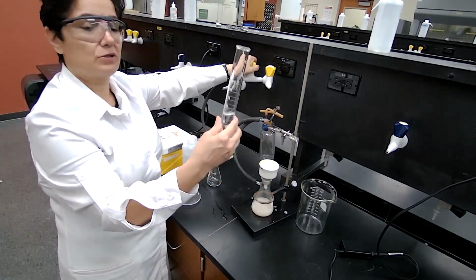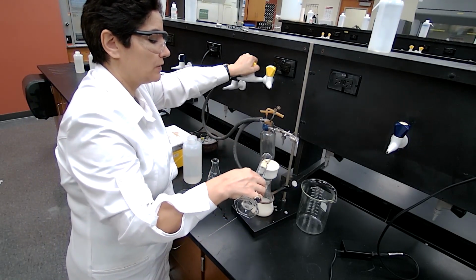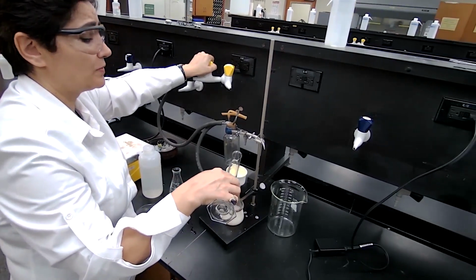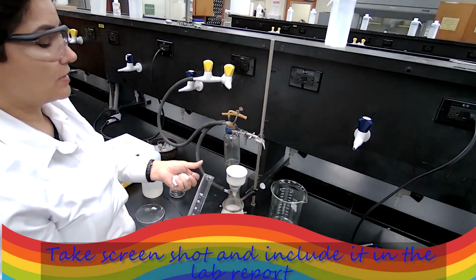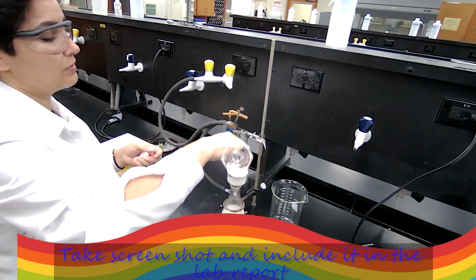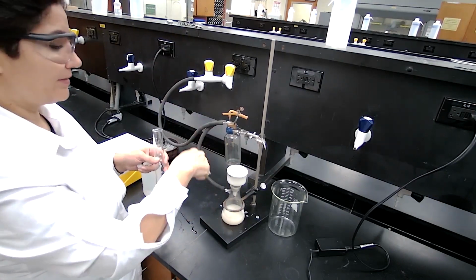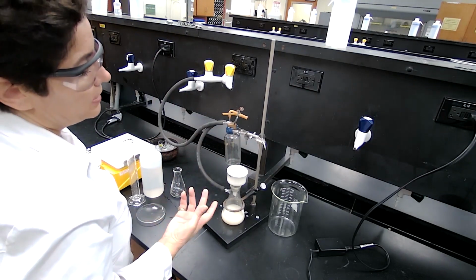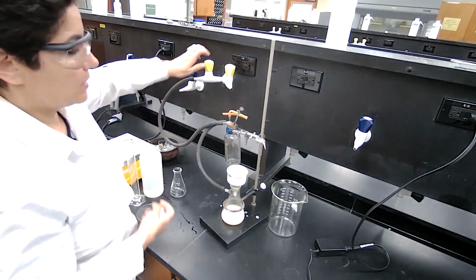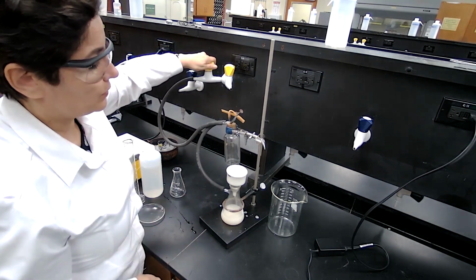Add the washing solution, which in this case is water, to the Buchner funnel and let the crystals soak in water. As I showed you in the past, when you pour the water when the vacuum is on, it can pull it down in one area, not the entire sample. We wait for maybe 30 seconds and turn on the vacuum. 30 seconds to a minute, it doesn't hurt to wait.